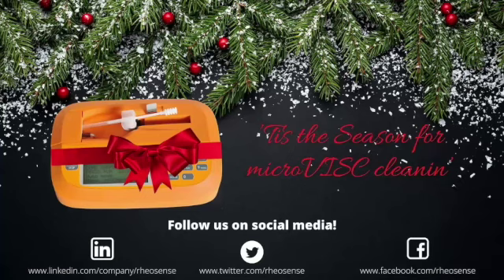I'm gonna slide this and turn it around. All right. So I'm just gonna go into a little detail on the importance of cleaning your chip real quick. As Nate pointed out, we just ran some syrup through this. Obviously, if you were to leave this in the chip and not do any cleaning, it would start to get hard, and then it might almost be impossible to clean out.